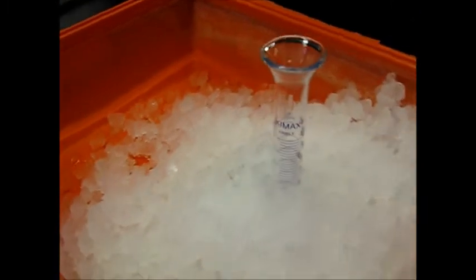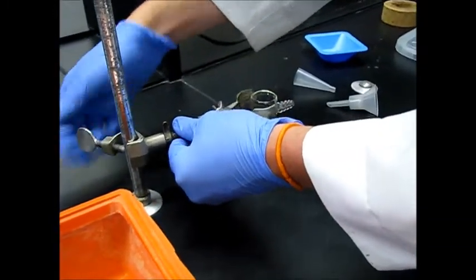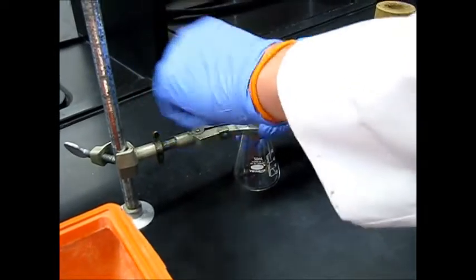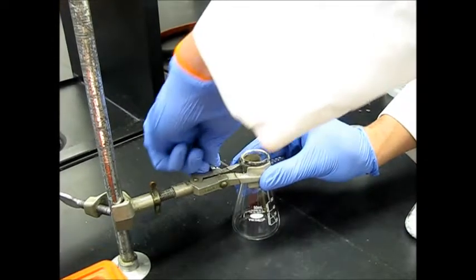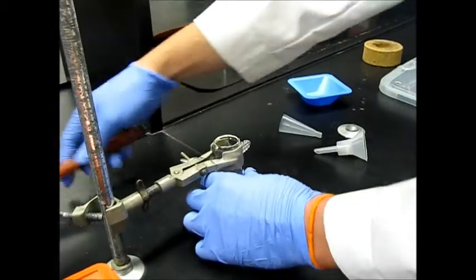Next, what we need to do is set up the vacuum filtration. So we'll lower our clamp down. We're going to go ahead and attach our vacuum.